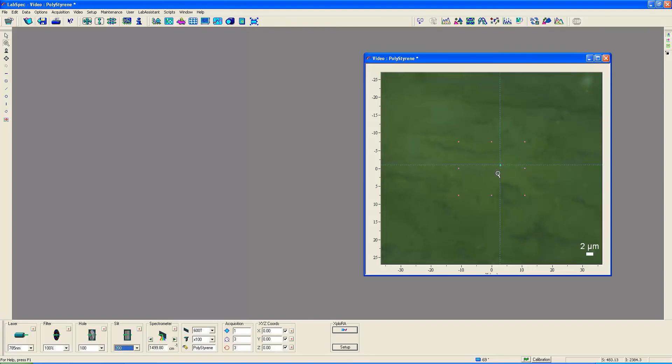And what you see here is the surface of a piece of polystyrene pipe. It's just a piece of plumbing purchased from a hardware store, but as you'll see in a moment, it has some very interesting characteristics, and I think will very helpfully demonstrate to you the confocality of the instrument.